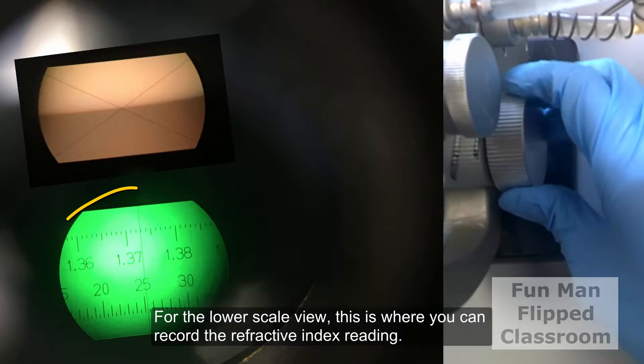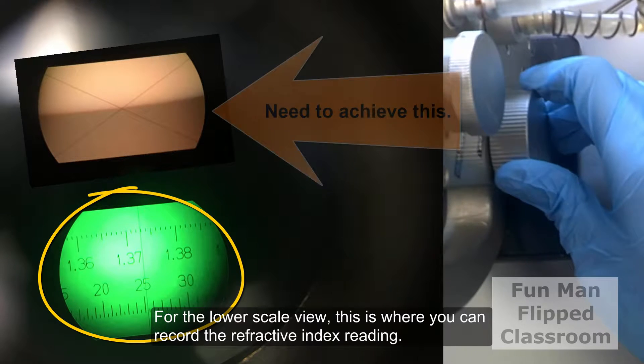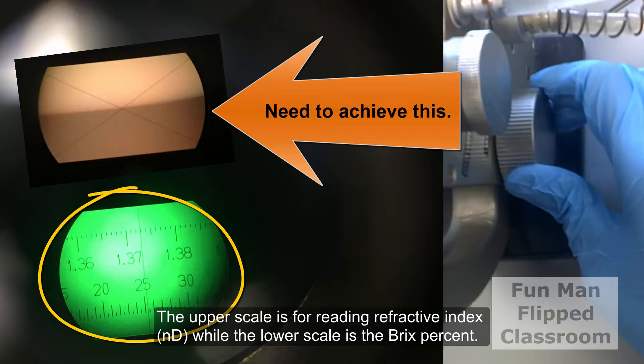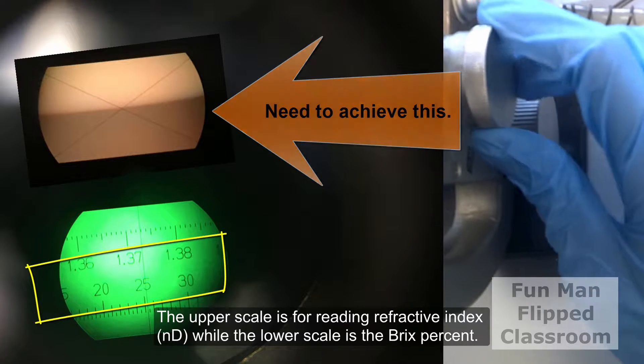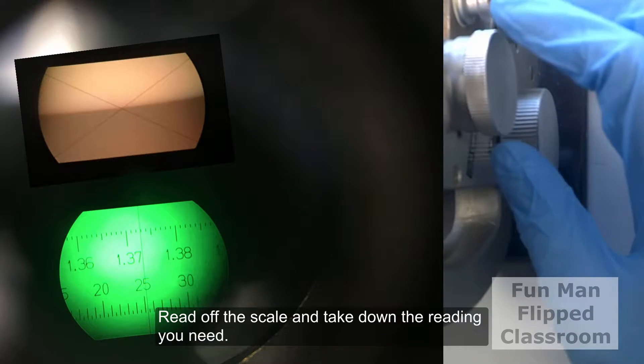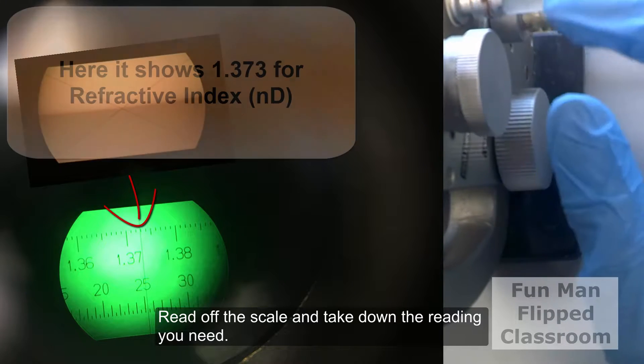For the lower scale view, this is where you can record the refractive index reading. The upper scale is for reading refractive index, while the lower scale is for the Brix percent. Read off the scale and take down the reading you need. That's it!